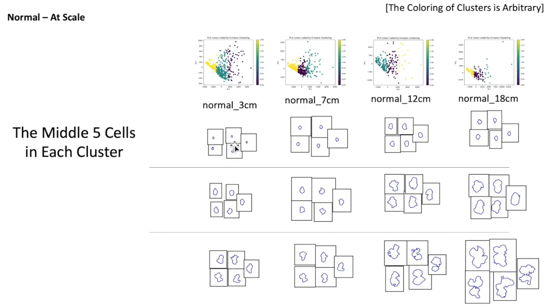You have the simple, small, circular shapes, and then you have these medium-sized, more complicated shapes, and ultimately you have the large amoeboid complicated shapes. And as you increase more and more pressure into the lungs, the alveoli expand into more and more complex shapes. Right here, we call this the butterfly morphology. So these are the fully expanded large alveoli in a healthy lung.